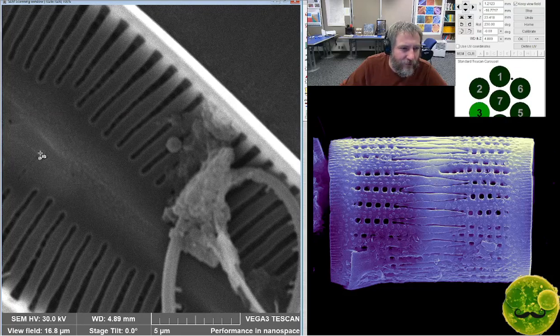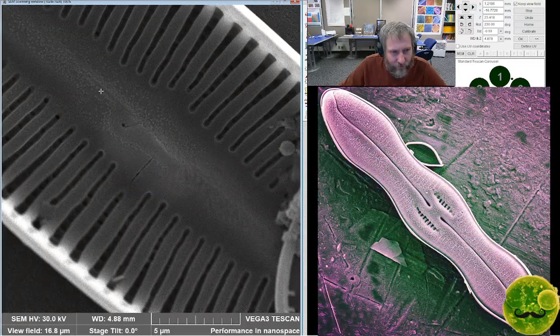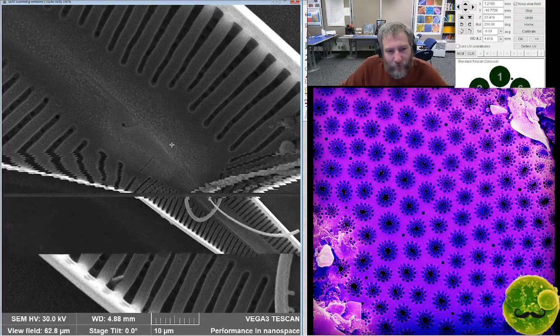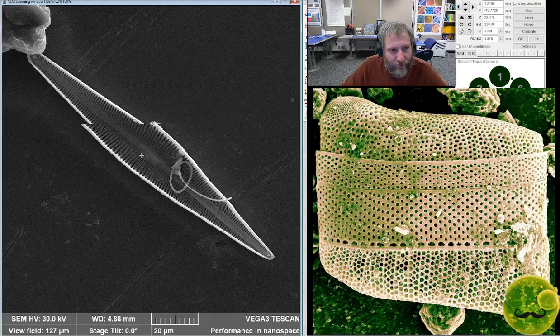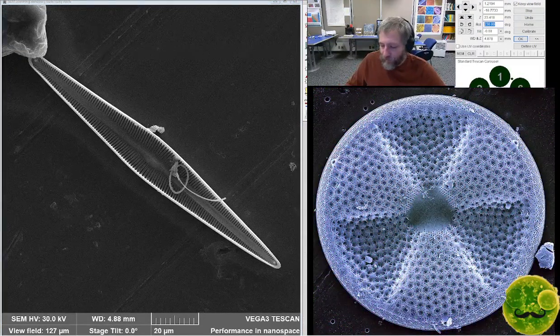So, similar structure to the raphe on this diatom. Here's the bent sharply back ends and a slit-shaped stigma associated with a single stria. Same group. I think this one is Gomphonema killamai, named after a famous diatomist, Peter Killam, who worked in East Africa. And I think rather tragically died early.